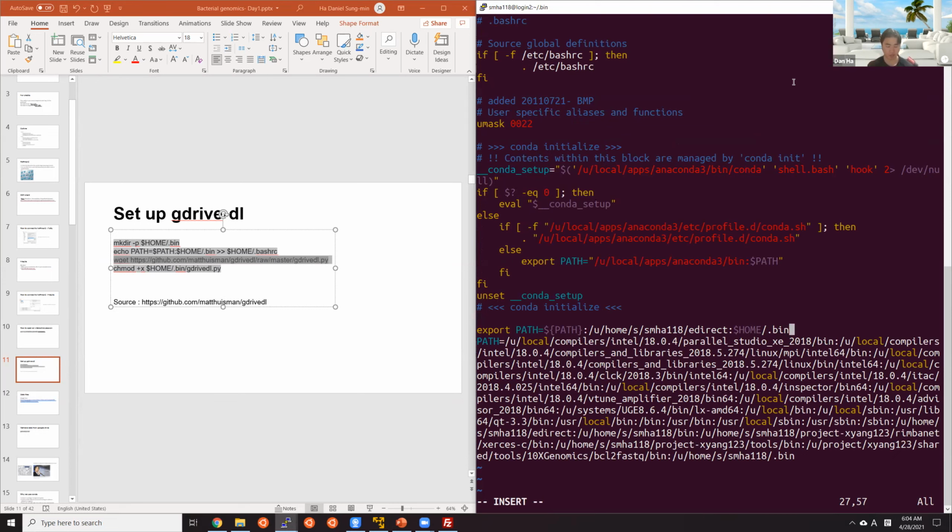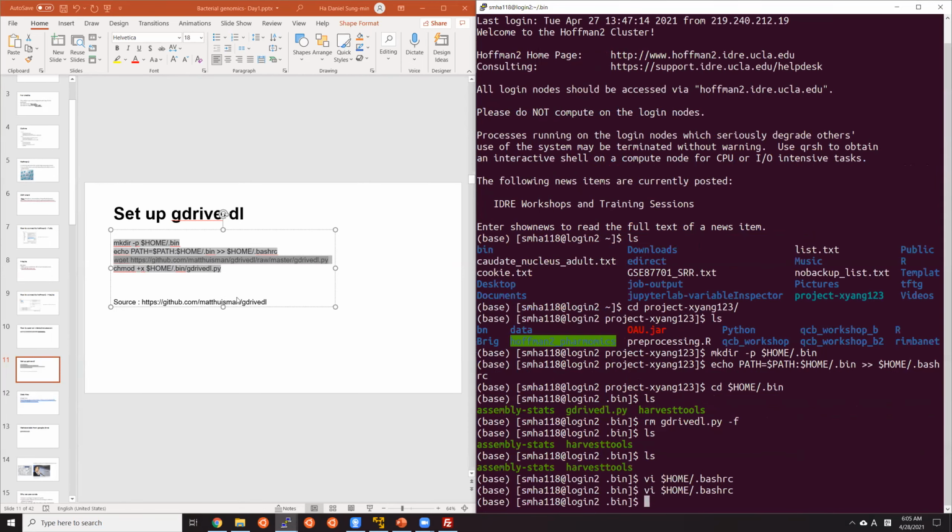And once you have done that, you can save the file with shift colon on your keyboard, and it's going to show this colon sign at the very bottom. And you can type in wq. w means write, and q means quit the file. So save and quit. Awesome. Thank you.